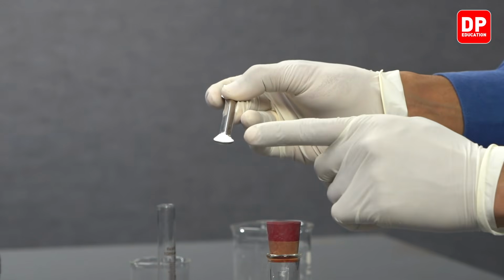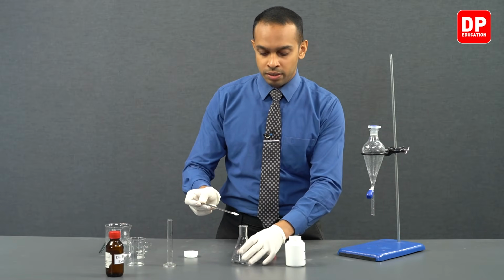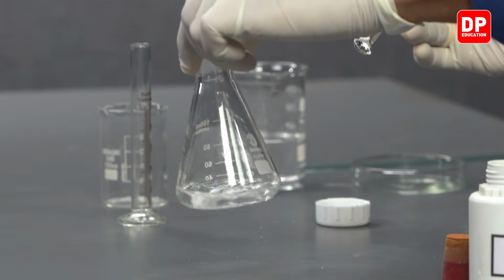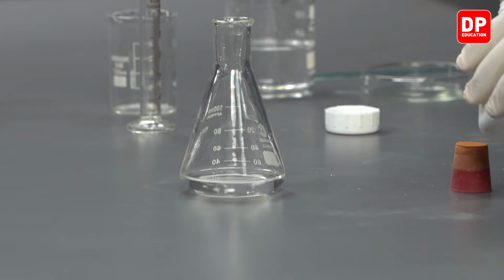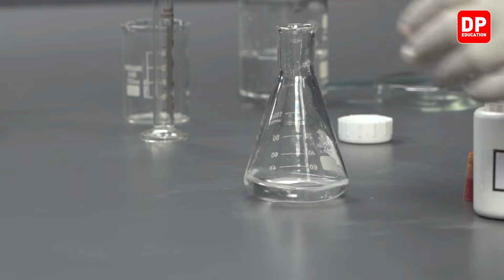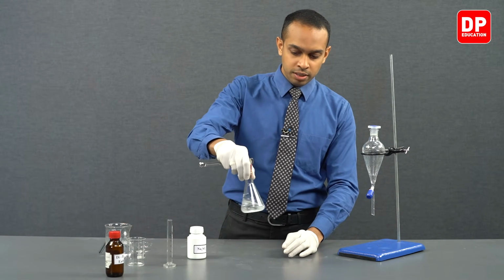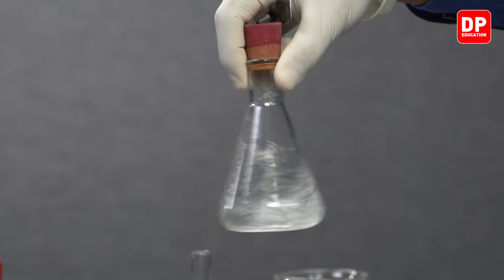We will take a small amount of sodium sulfate and we can add this sodium sulfate into our diethyl ether layer. We will mix it for a while to see if the sodium sulfate is clumping together.